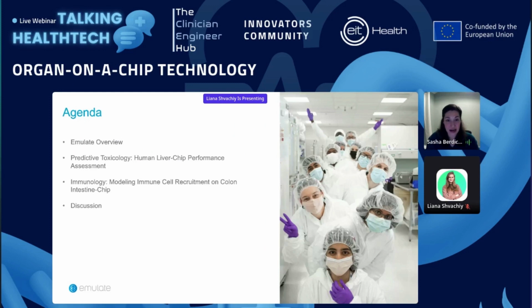On the agenda today, I will give an overview of Emulate as a company, as well as of organ-on-chip technology as a field. And I will touch on two major studies that we performed this year. One is predictive toxicology, the human liver chip performance assessment. And another is the immune cell recruitment in the colon intestine chip. I chose those because these were really important studies that hopefully will be interesting for this audience, because they are as close as in vitro studies can be to human physiology.